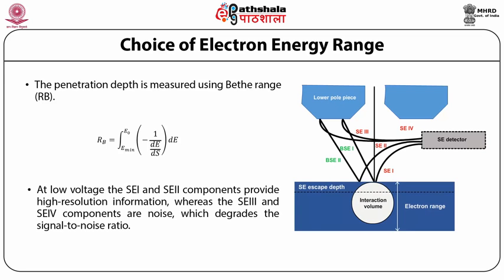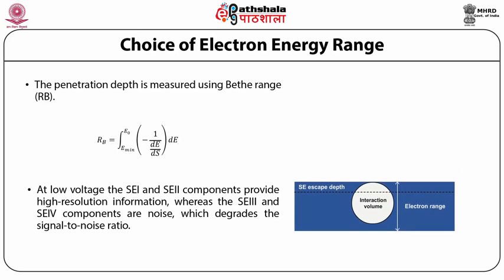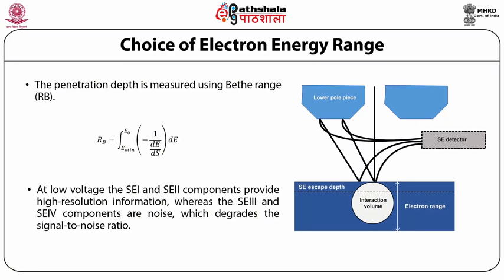The low voltage image is more sensitive to the chemical nature and topographic form of the specimen surface. In low voltage SEM, since all the signals are produced near the surface of the material, even very thin specimens could behave as bulk. The relationship between the secondary electron and backscattered electron BSE images could be reversed under low voltage operation.